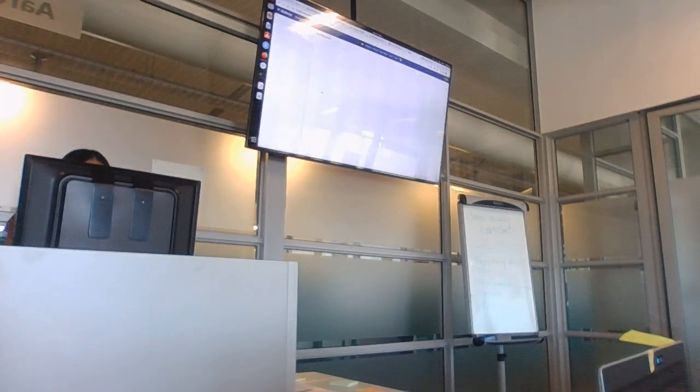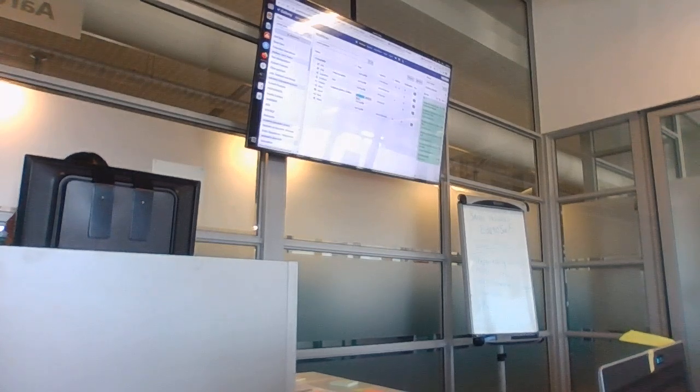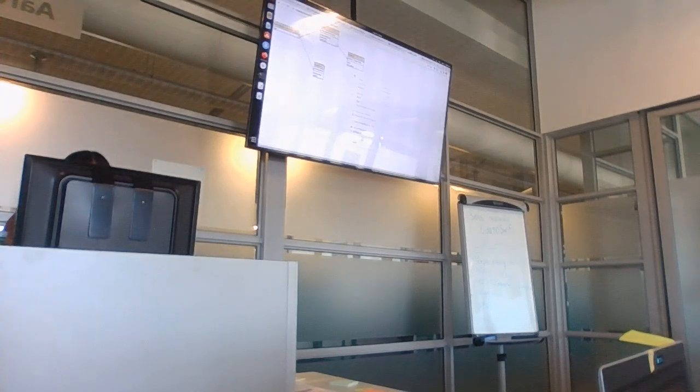So if you go to export and then you get create image here, we're talking about this one. That's the one I showed earlier. If you don't like that format, once you're able to create an SVG image, please check the workflow. Really? Are you saying that even though the option is there, you can't actually save it? Where is the actual save button? That is actually interesting. Let me write to them.